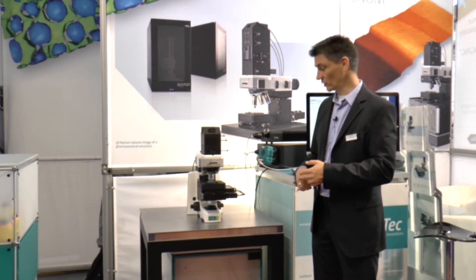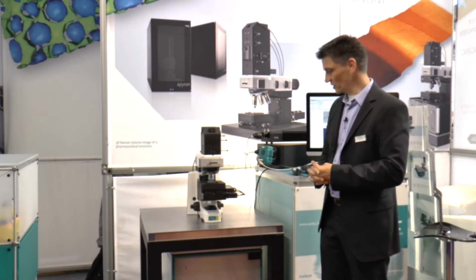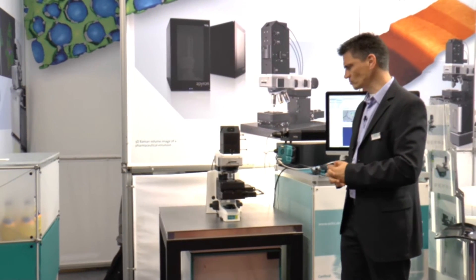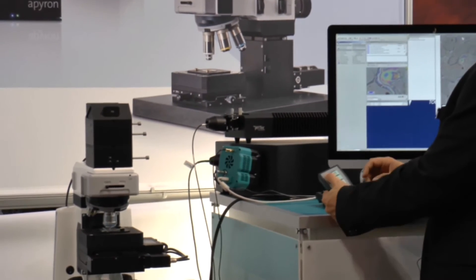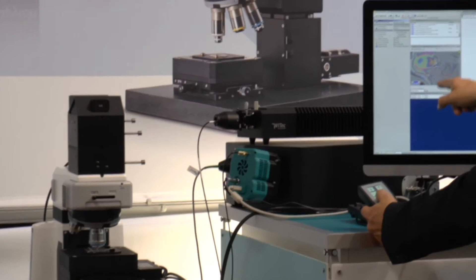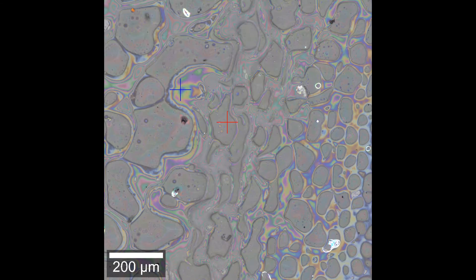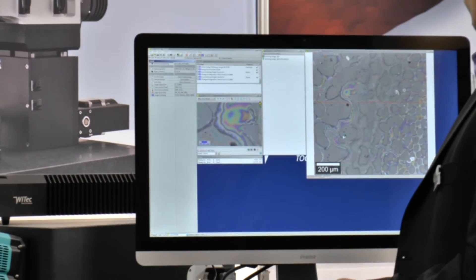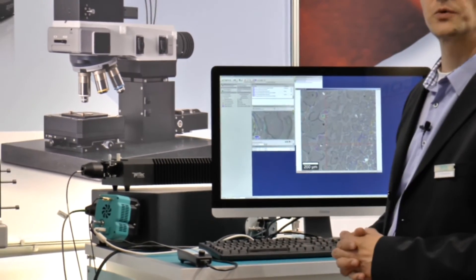Even epifluorescence imaging is possible. The example here is a polymer on a glass cover slip — a mixture of polystyrene and PMMA, extremely thin, in the range of a micron or less. What we see in the video is a live video stream. If I move my sample using the remote control, the video image moves with it. Earlier I did a stitching image showing a millimeter by millimeter of this sample, significantly more than the objective alone can do. There are no visible borders, which comes from the high-quality Kohler illumination. If the illumination were not as good, you would see squares. You can also drive to various positions — clicking here drives the video to that position in real time.